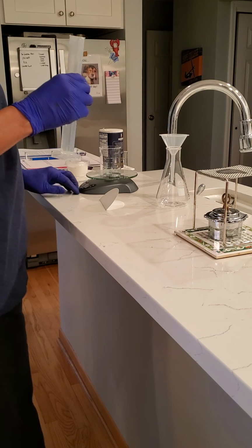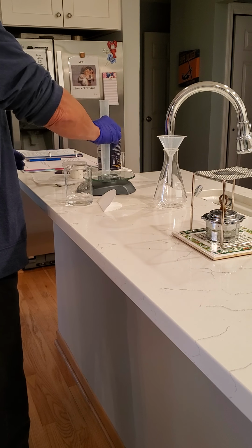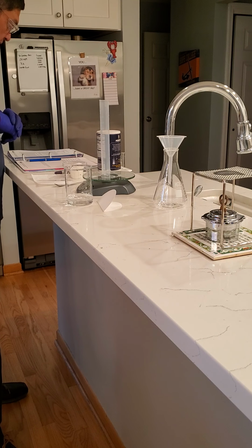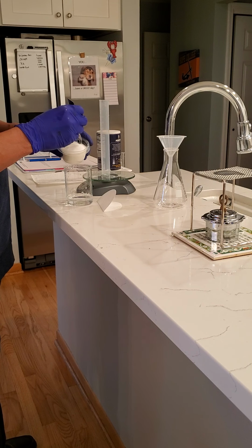Okay, class, so I've got 50 mils of water in my graduated cylinder. I'm going to add it to the beaker. And then I'm going to start adding salt to the beaker, and we're going to keep adding it. Wait about 15 minutes to be sure that there's still solid in the beaker after we've dissolved as much as possible.